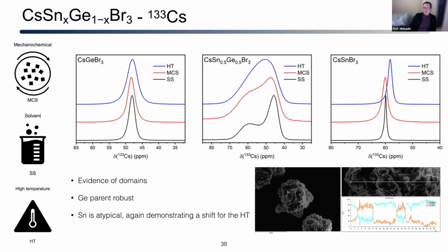The idea behind that is if you look at the microcrystals that we make, if you do a line scan through the EDX, you basically have this interflipping between a germanium-rich phase, then a tin-rich phase, then a germanium-rich phase, and then a tin-rich phase. What I like to think about is, if you're in the environment and we wait thousands of years and you're forming a mineral, the ions around allowing that to precipitate out will be dominated by either germanium or tin.